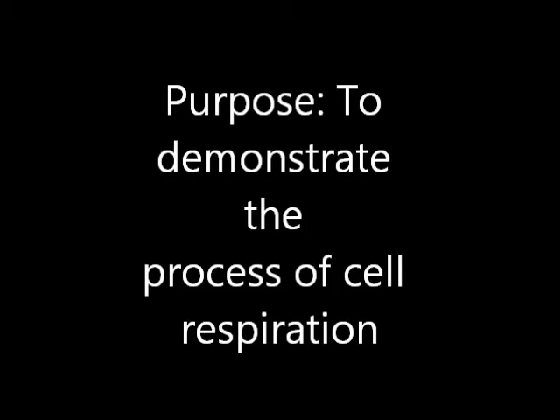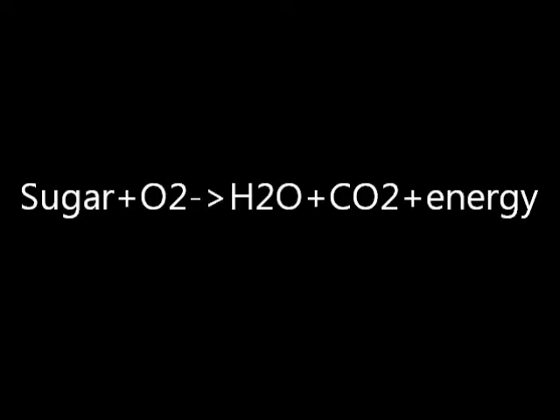Hello and welcome. Today we're going to be reviewing a lab on cell respiration. The main purpose of this lab is to demonstrate the active process of cell respiration, which involves converting sugars and oxygen gas into water, carbon dioxide, and a usable energy, in this case ATP.